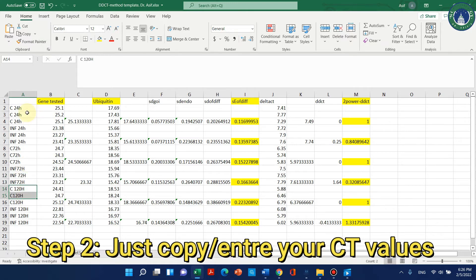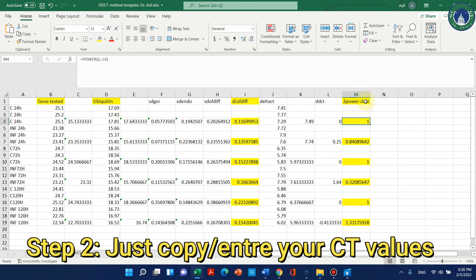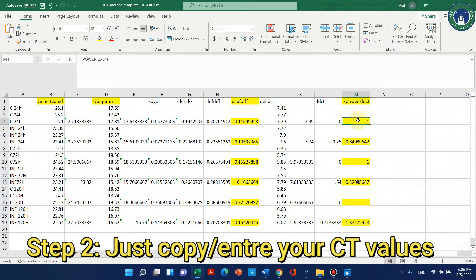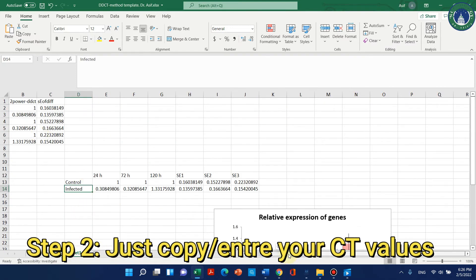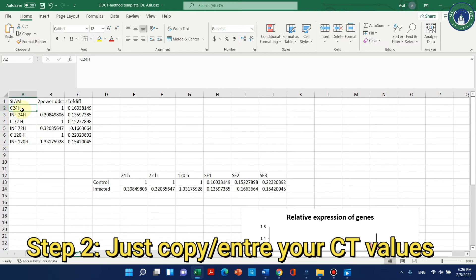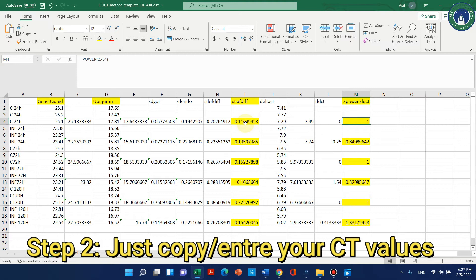When you enter your CT values here, it will automatically give you values using the delta-delta CT method. For control at 24 hours, the first delta-delta CT value is automatically normalized to 1, and the standard error of difference is also calculated. You just need these two values — the relative expression value and the standard error. For example, for C24 the delta-delta CT value was 1 and the standard error of difference was 0.16. For the next condition the values were 0.84 and 0.135.